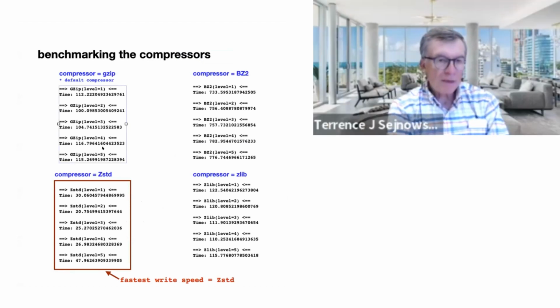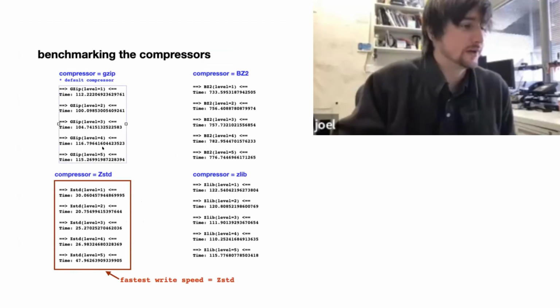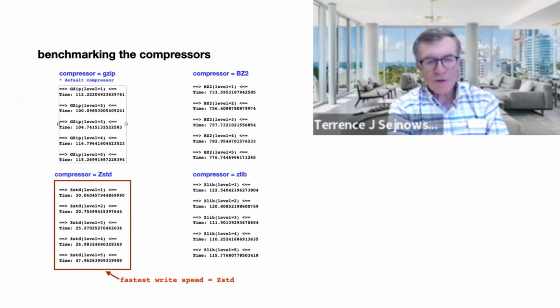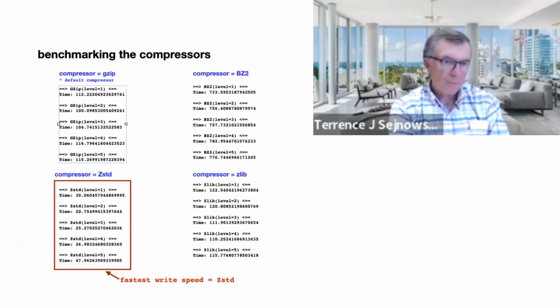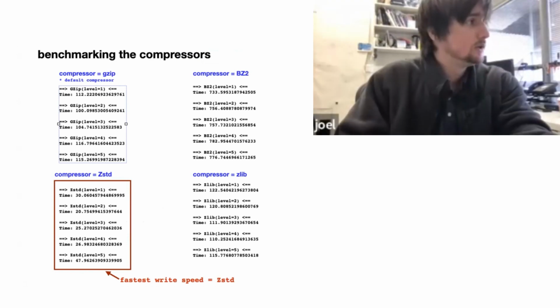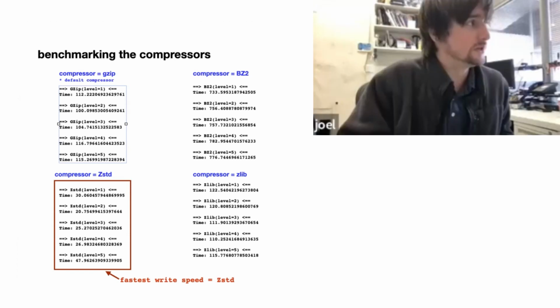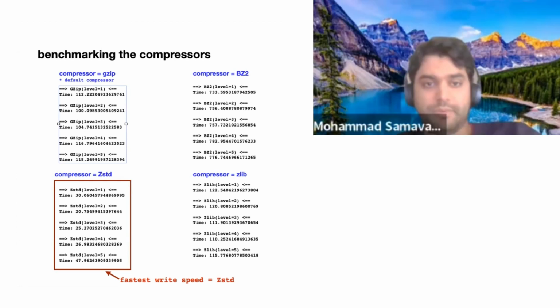What does ZAR mean? What does it stand for? Good question. Well, you don't have to answer it now. I'm just curious. I don't actually know. It sounds like something from science fiction. Well, I can tell you the Z stands for Z-stack. Zip. Oh, no, Z-array.